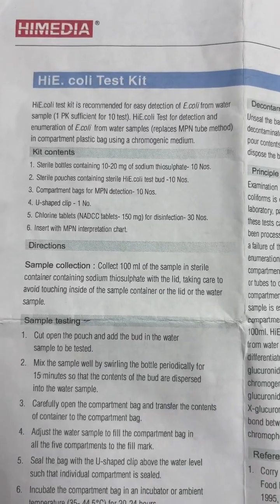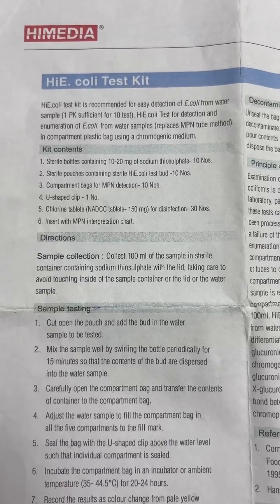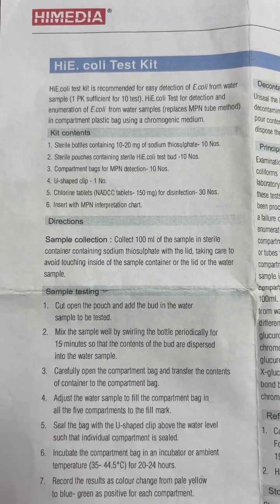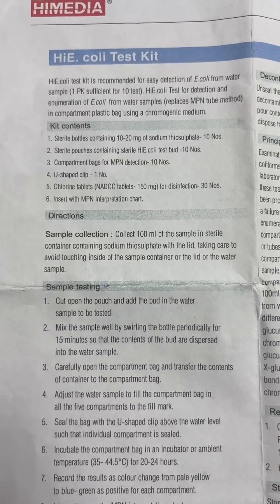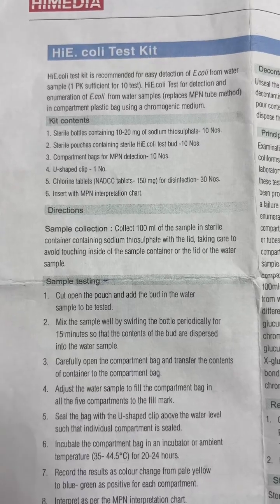The High Coli test kit is recommended for easy detection of E. coli from water samples. High Coli test is used for detection and enumeration of E. coli from water samples in compartment plastic bags using a chromogenic medium. The kit contains sterile pouches.